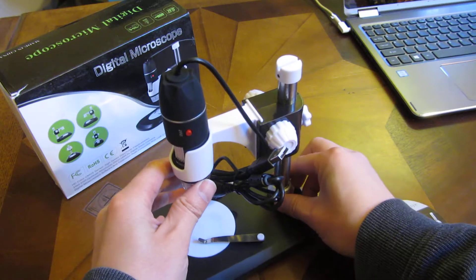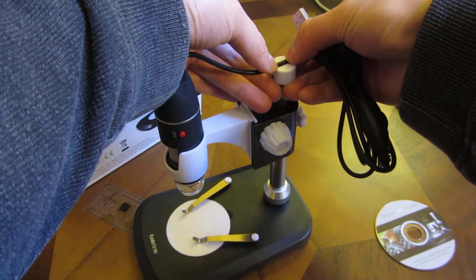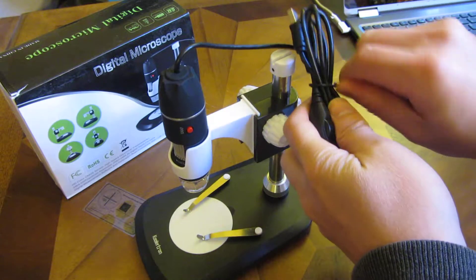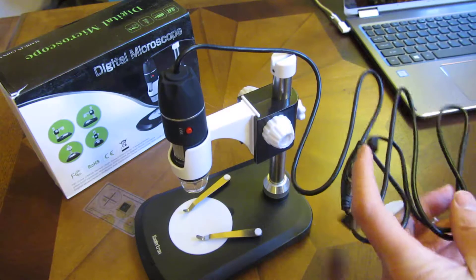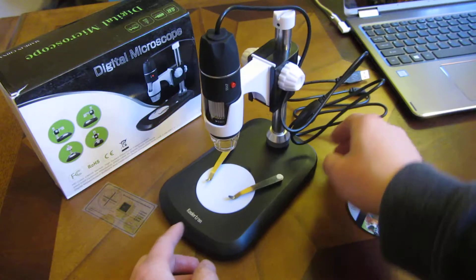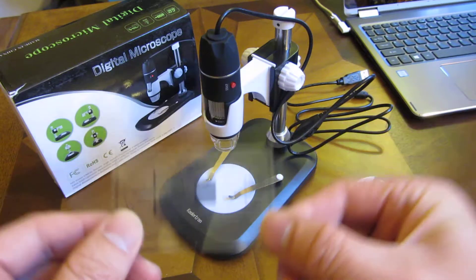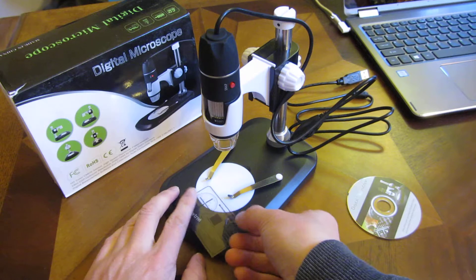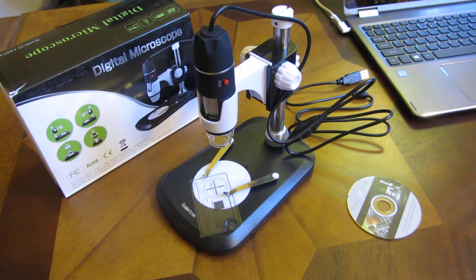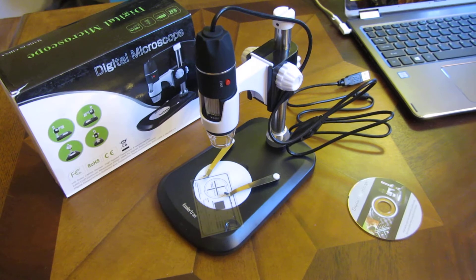Let me adjust it. Now I am going to rest the camera wire up against this here and plug it in — I'm going to plug this into my computer now. It also comes with this measurement template, which gives you relative measurements. Let me go ahead and plug it into my computer and show you the operations of this USB microscope.